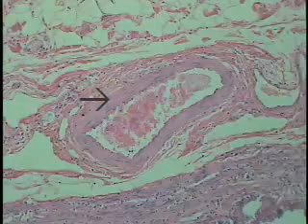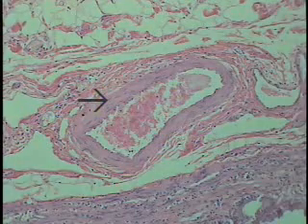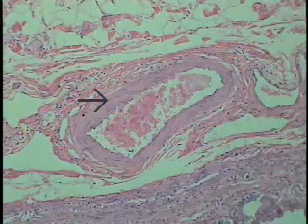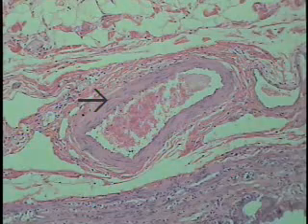An excellent place to look, because of its very vascular nature, is in the wall or the adventitia of the gallbladder. The small arteries will show a very prominent media. There's one located here in the center of the field of view, so this is an artery, always characterized, as is the aorta or the elastic, the muscular arteries, all through the arterial system by the dominance of smooth muscle in the media wall. Indeed, some may be modified somewhat, as in the elastic or the conducting type of arteries, but a prominent feature is always the smooth muscle in the media wall that forms a donut, a very prominent ring, all the way through the system, all down to the smallest arteriole.